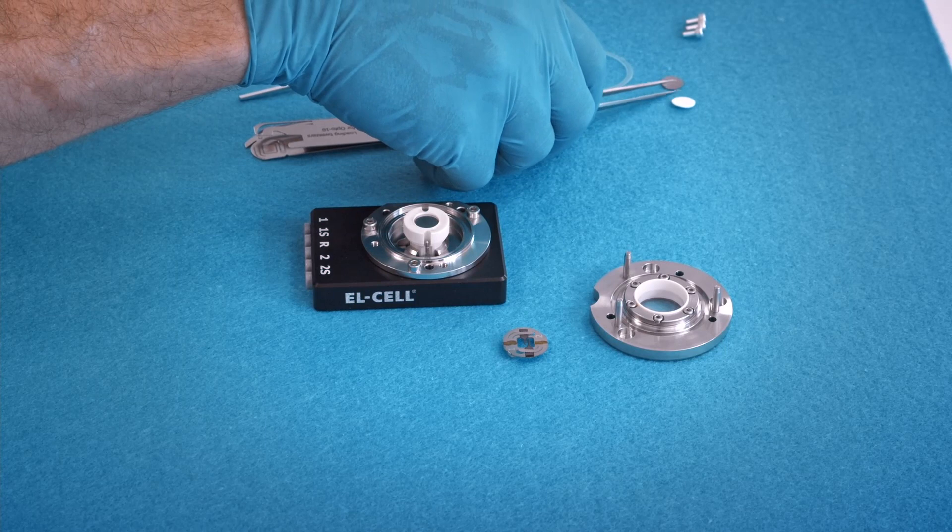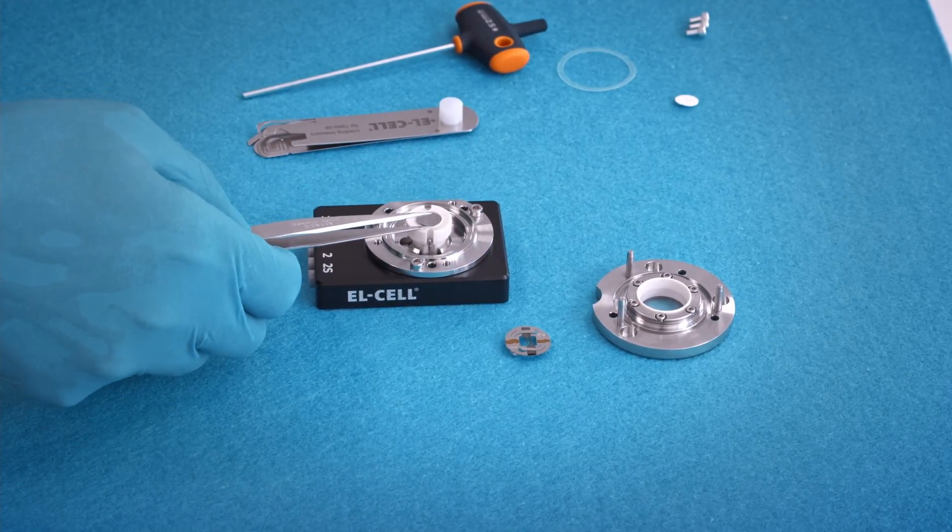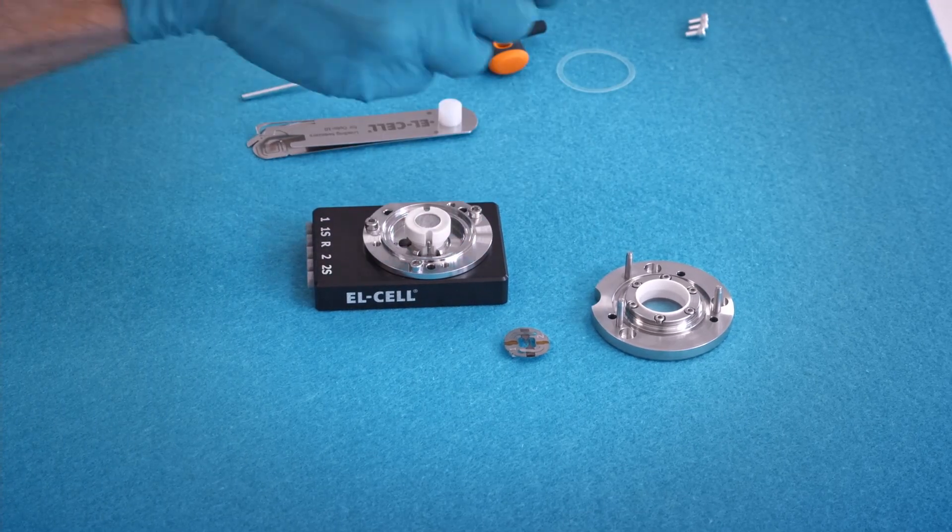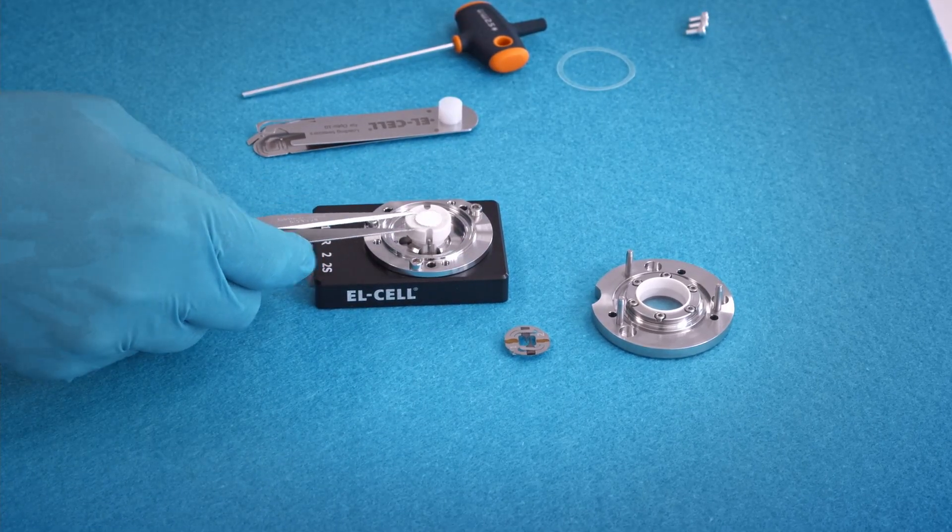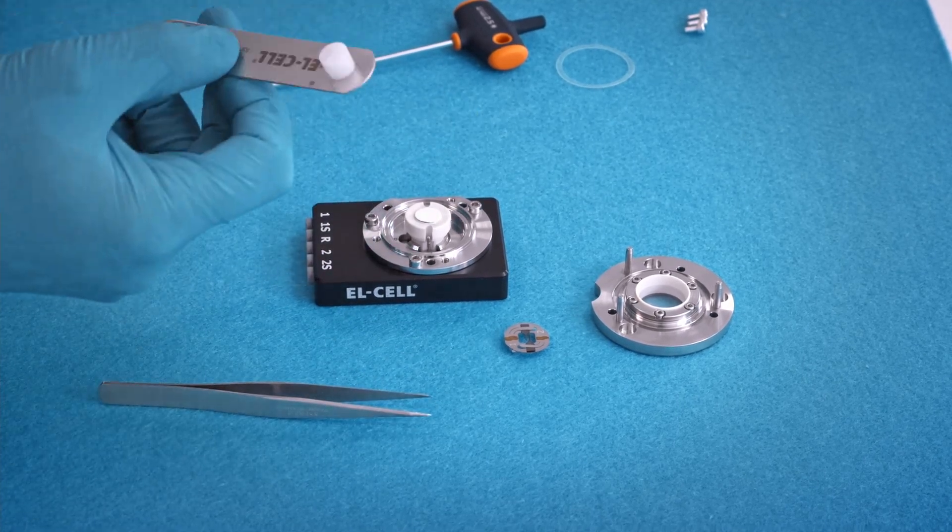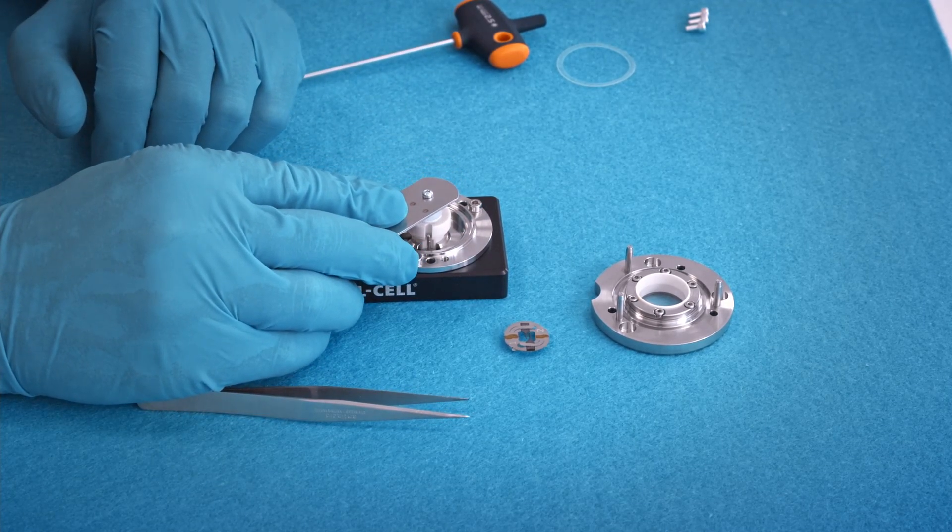Next we put in the lithium metal onto the central plunger. Put the glass fiber separator 10 mm diameter on top. The glass fiber disc can also be smaller to prevent that the sample holder is in contact with the electrolyte.